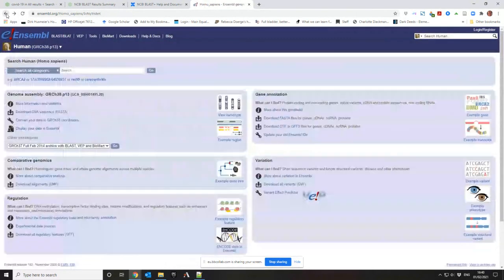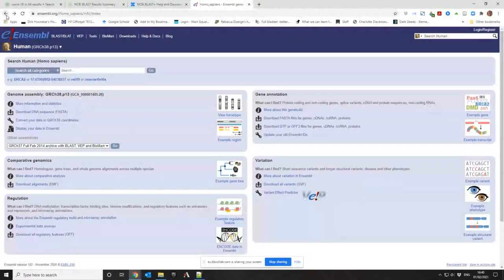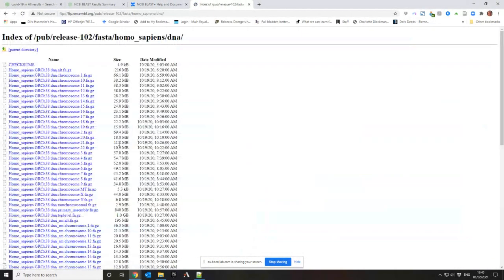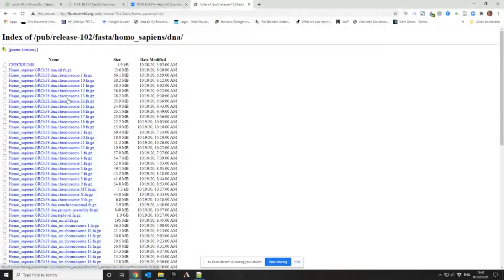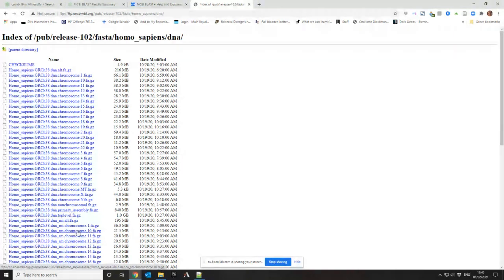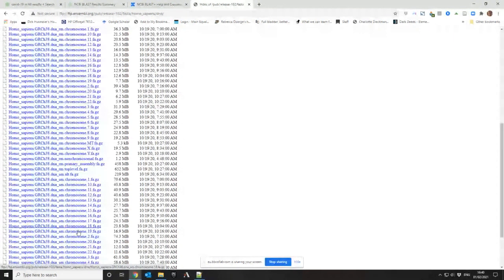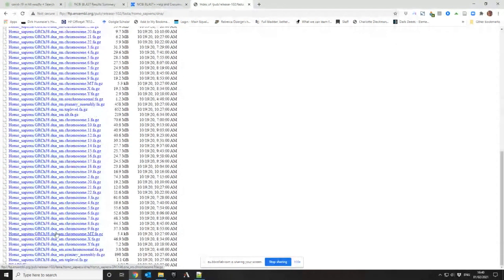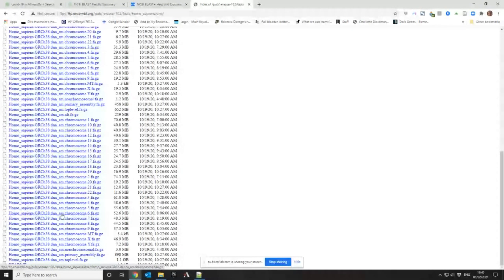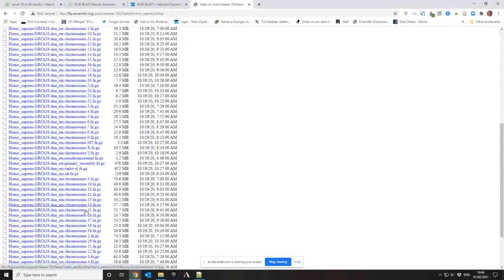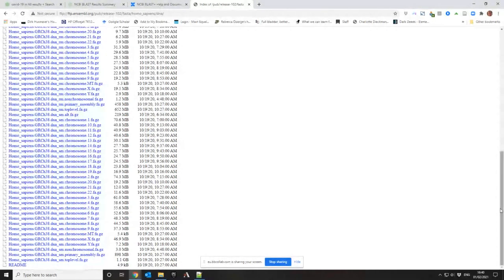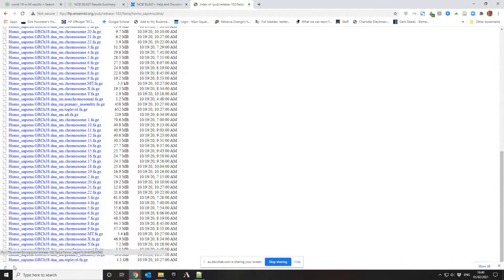Genome browsers are quite good if you're looking for something from a specific organism. I could download the DNA sequences, so here are the FASTA files for the DNA of each one of the chromosomes. I don't know why it's got DNA—what does DNA SM stand for? Let's have a look where it says the file called README. If you don't know what anything is, you want to read the README because the README will tell you what it is.